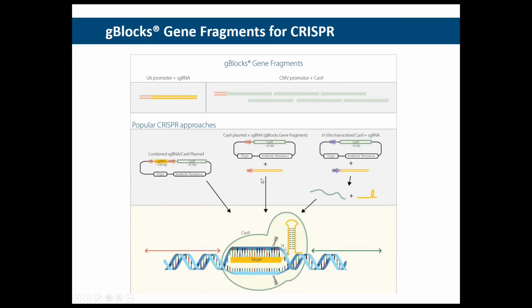And by doing so, you can really modulate the expression of the RNA from this and have really limited expression. This is important because, as with any genome targeting system, whether it be CRISPRs, TALENs, or zinc fingers, there is a certain degree of off-target effects.